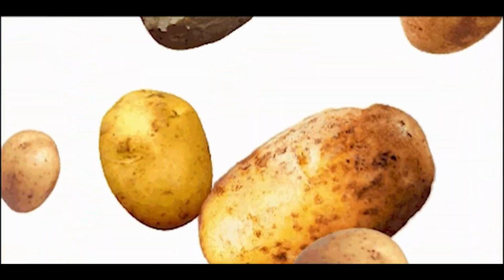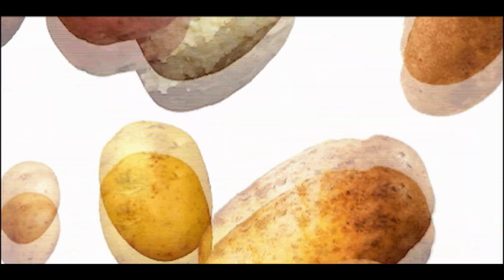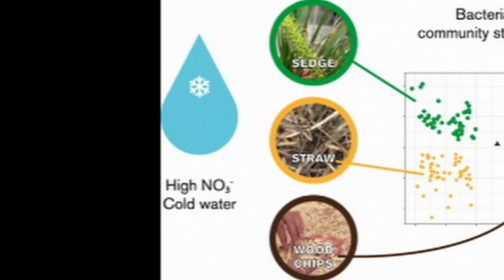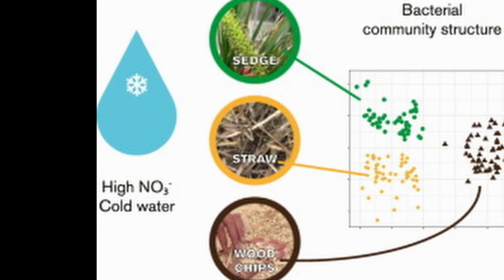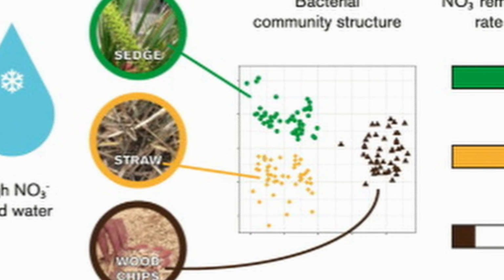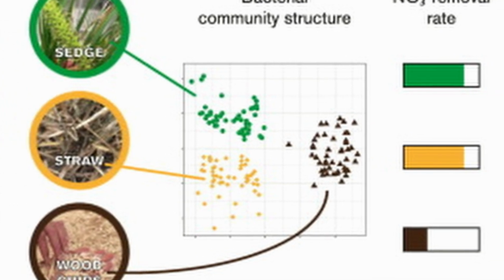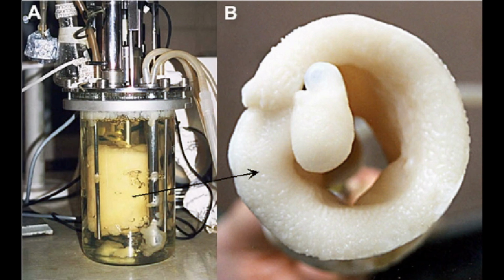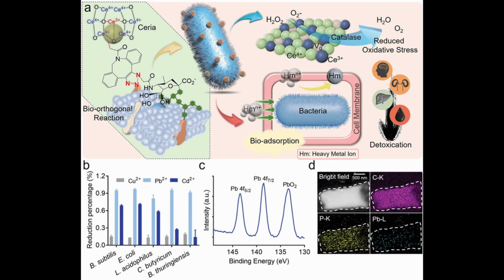The substrate, in case you're wondering, is the thing that is being used up by the different thing that transforms it. Basically like food, or waste, or whatever it is. Vegetables even. And the thing that converts it, we call it a biomass. It can come in many different forms. Fungi, bacteria, any microorganisms, or even just straight up enzymes.